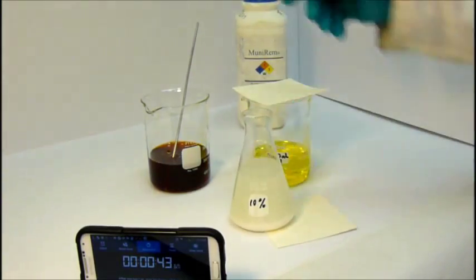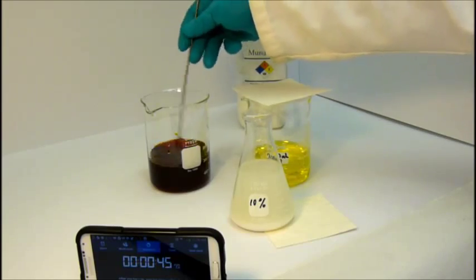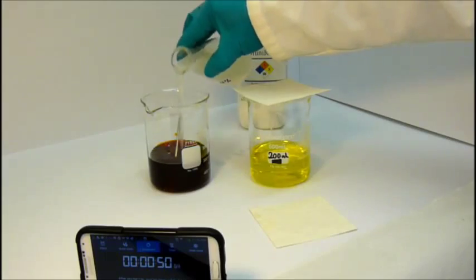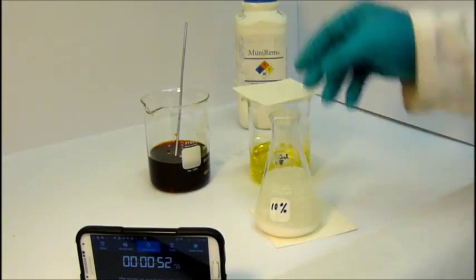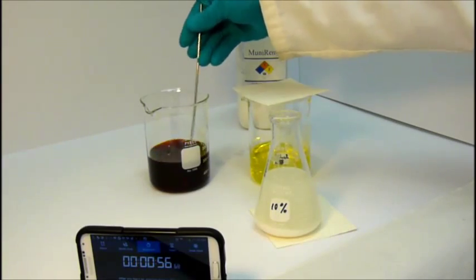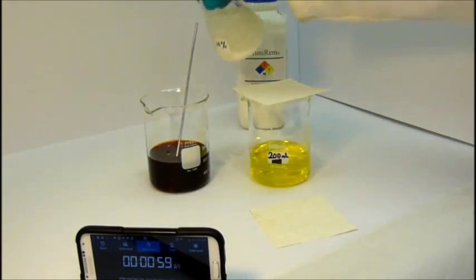Tests have shown that the picrate contamination can be reduced to non-detectable levels almost instantaneously using Munarem. The same results have been demonstrated on TNT, RDX, HMX, lead styphnate, trinitroresorcinol, and many other explosives and propellants.